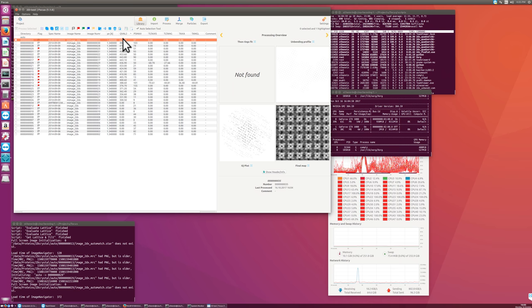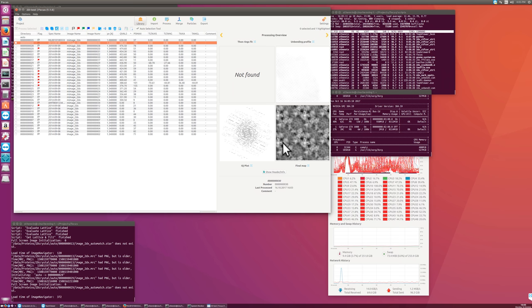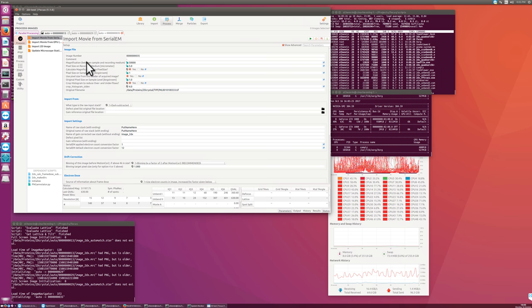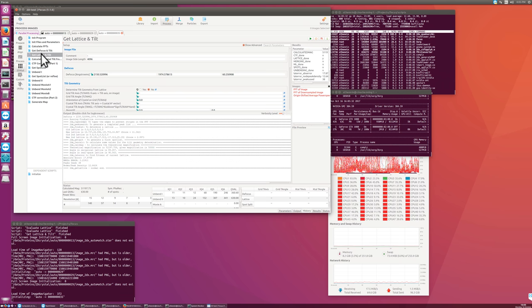That's probably a wrong lattice, and that's why the Q value is so high. Here we want to see 2x2 unit cells, and it should look like this, where we have one unit cell like this, then a second one to the right, and the bottom one here. But this image got the wrong unit cell, so I go in there. I think it's a non-tilted crystal, and the lattice was wrong.